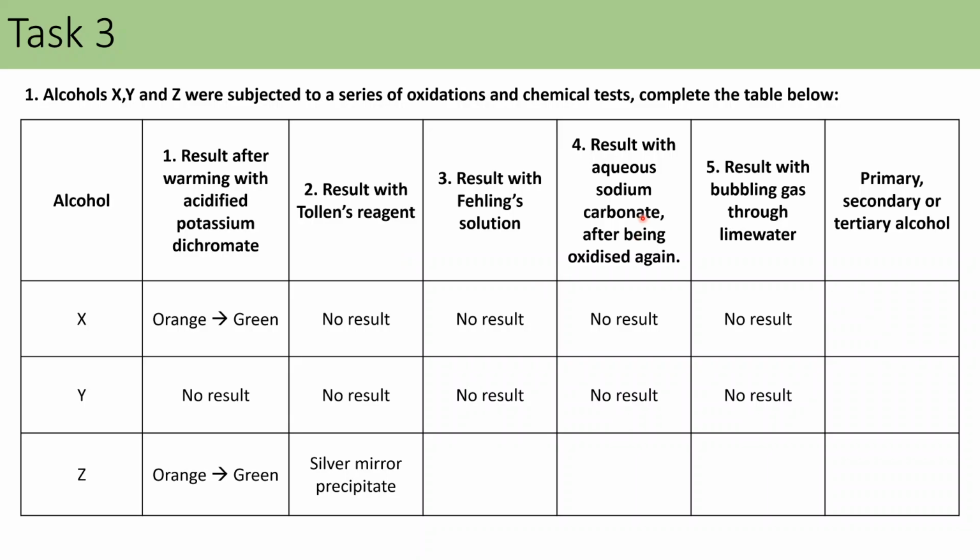And then I tested that with aqueous sodium carbonate. So think about what that's the test for. Bubbled that gas through lime water. So you've got a few blanks here to fill in the results for. It could be that you could expand these a little bit more as well. I've written no result, but if there's no result, what colour would it stay? Maybe you could change those as well. So try and add as much detail as you can to this table. Pause the video here, then come back to it, and then we'll see what you've got.